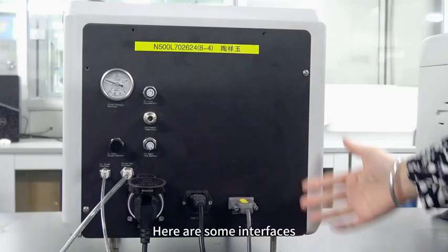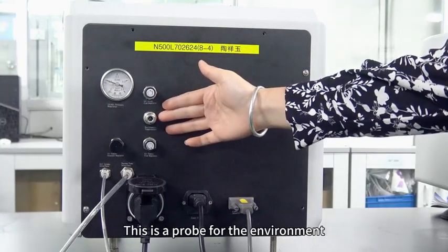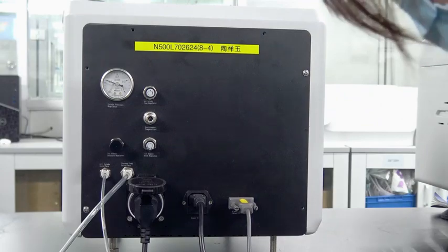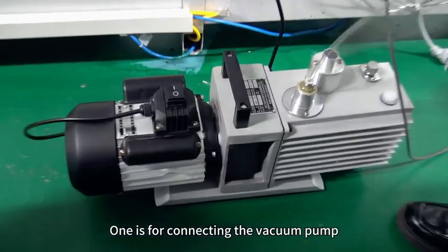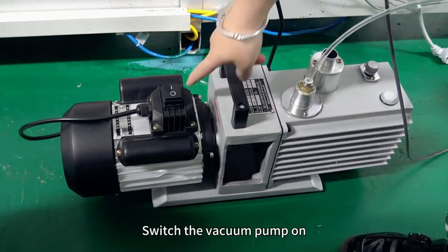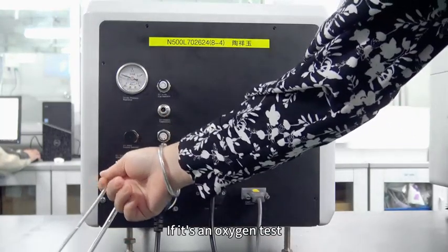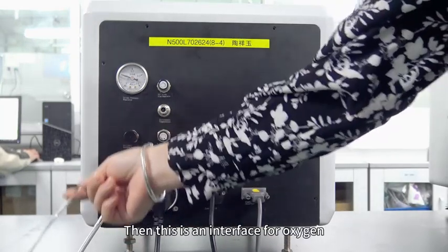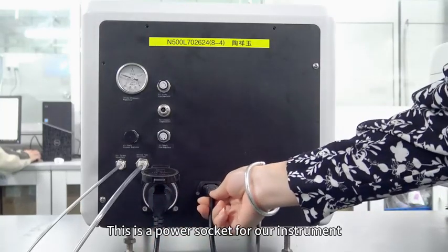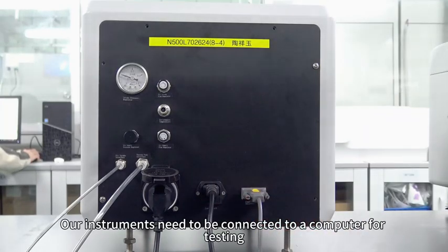The back of the instrument has the following interfaces: here is the air intake flow regulator, this is a probe for the environment, and this one is the air supply flow regulator. This is the air supply pressure regulator. There are two interfaces here — one is for connecting the vacuum pump. This is the gas source interface; if it is an oxygen test, this is the interface for oxygen. This is a socket for the vacuum pump — the vacuum pump generates electricity from here. This is a power socket for our instrument. Here is the communication interface; our instruments need to be connected to a computer for testing.